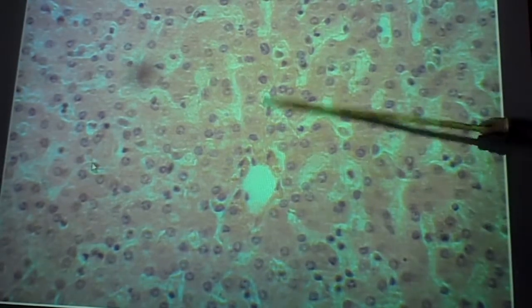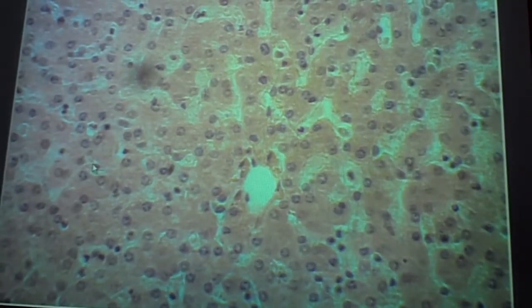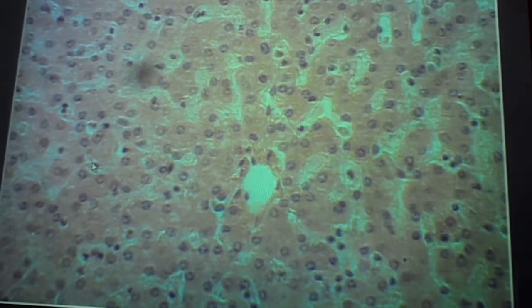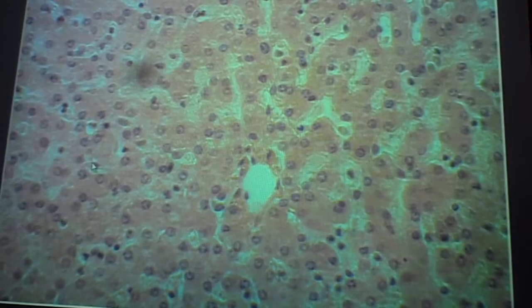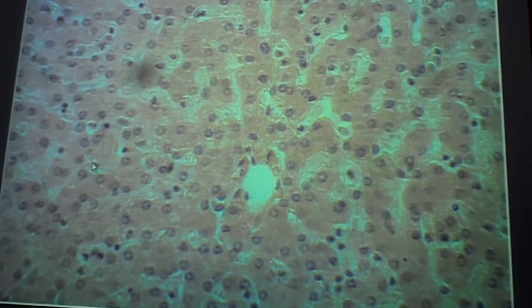and they drain into this. This is called a central vein. Okay? You look on your handout. This would be on page 10. Under liver, we've been through the lobes, been through the ligaments. That says lobules.